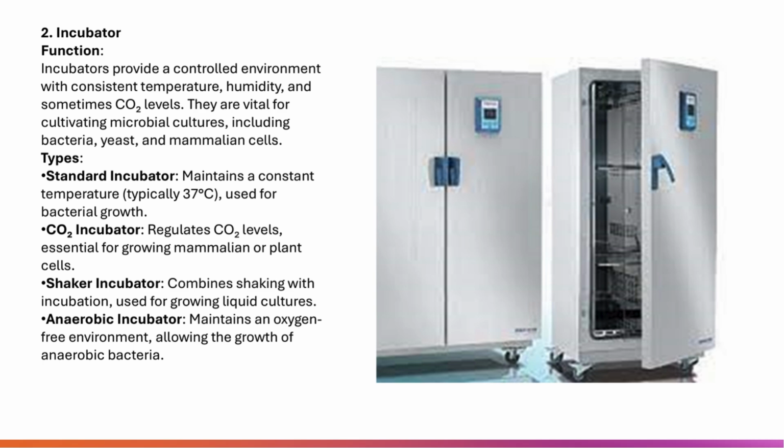Anaerobic incubator. An anaerobic incubator creates an oxygen-free environment, allowing you to grow anaerobic bacteria, which can only survive without oxygen. This type of incubator is essential for studying organisms that thrive in extreme conditions, like certain types of bacteria that cause infections.